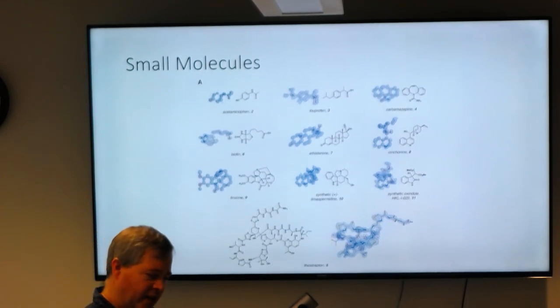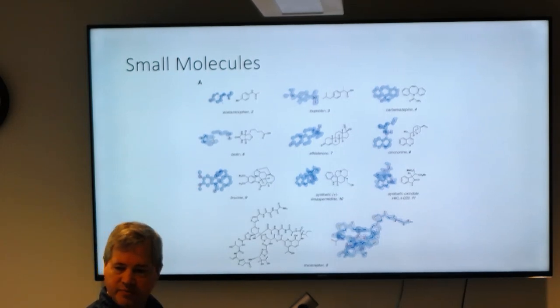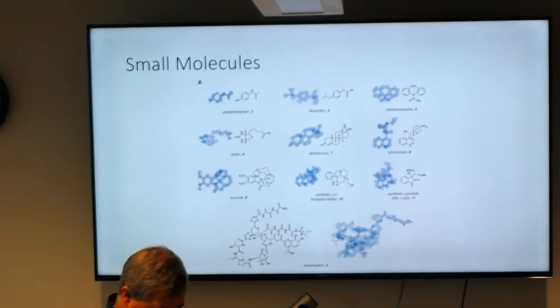I found that it helped to use a non-glow discharged grid, although this is just 1 or 2 times. Somehow it seemed to be better with a hydrophobic grid than a hydrophilic grid. But that's just n equals 1 or 2.